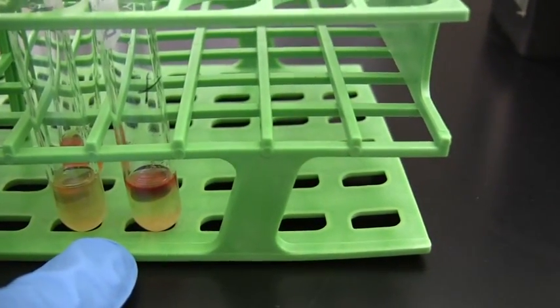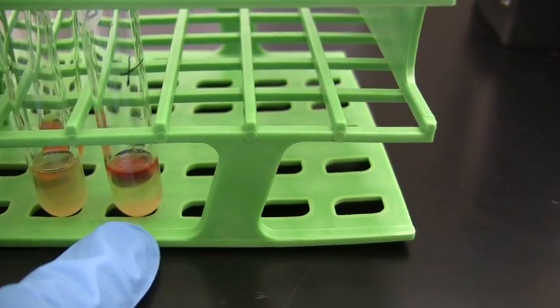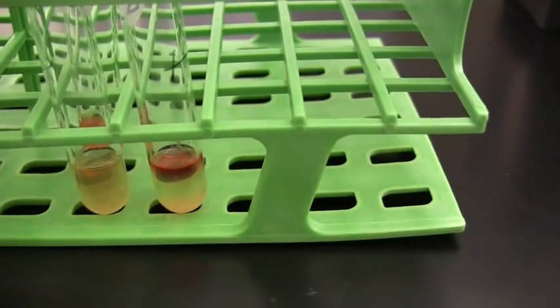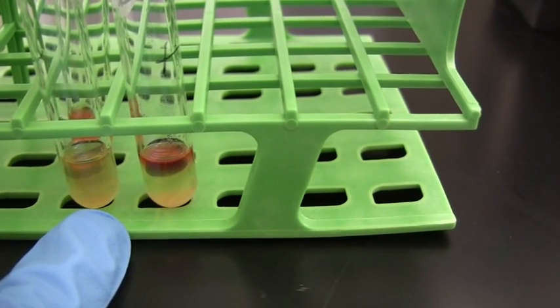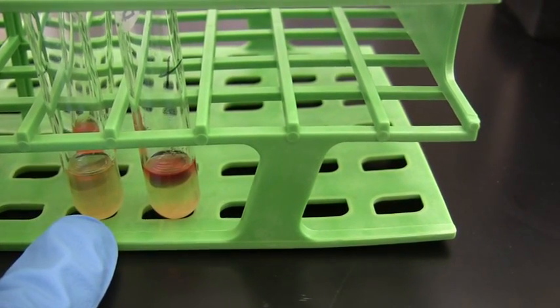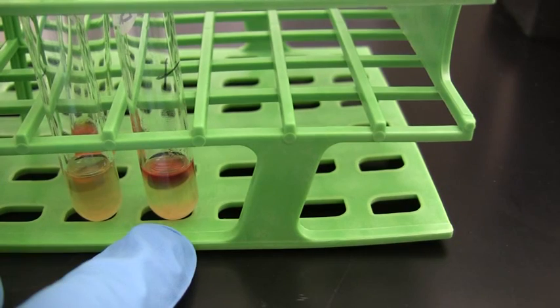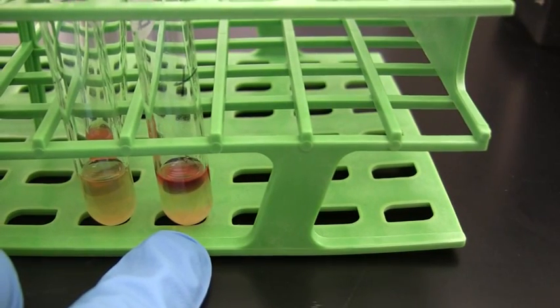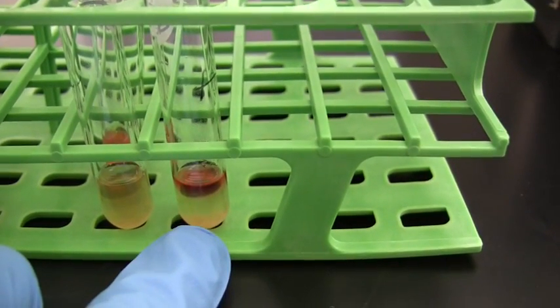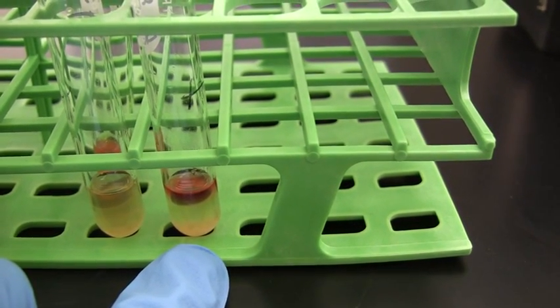Now, taking a different bacterium over here on the right, I now have the same setup. I have a methyl red test against a VP test. I took, again, a different species of bacteria, but put the same species in each tube. It's, again, a broth that's split in half with glucose. And I added methyl red in one tube to test for acid products in that particular tube. And then I added the VP A and B reagent to test for a pH change, again, neutral to maybe even slightly alkaline. What I'm looking for in particular is 2,3-butanediol.